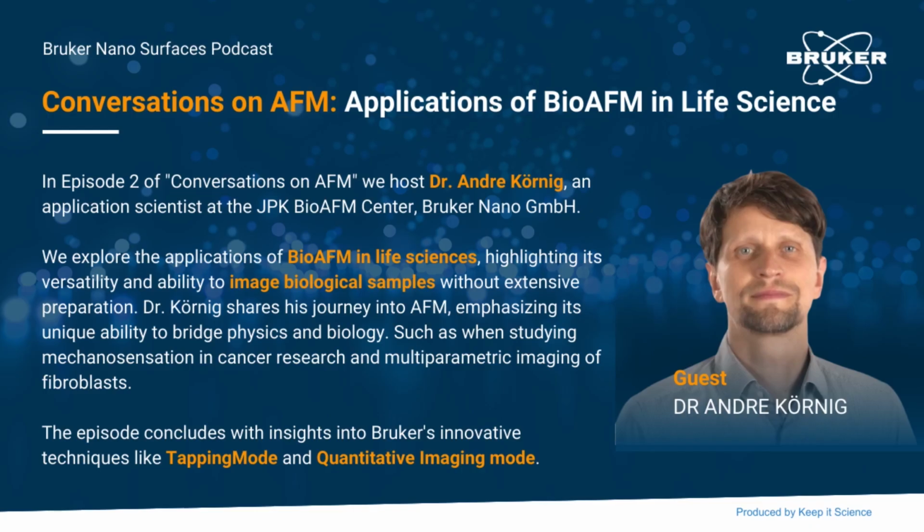I mean, but just thinking about it, sometimes we do have problems where people say, can you measure this? And then, but is it somehow on the surface? And this is the only thing where we sometimes run into communication issues about what the sample preparation is about. But mainly it's the point that it has to be somehow lying down to be able to touch it.